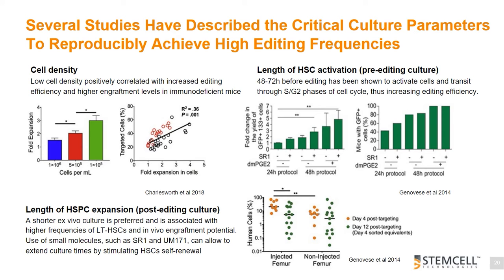Last but not least, the length of post-editing culture plays an important role in optimization of gene editing workflow. This culture length should allow for assessment of editing efficiency and functional effects of editing while preserving primitive HSCs. A shorter ex vivo culture is preferred, and as shown by the findings from Genovese et al., is associated with higher in vivo engraftment potential when comparing 4-day versus 12-day post-editing culture.